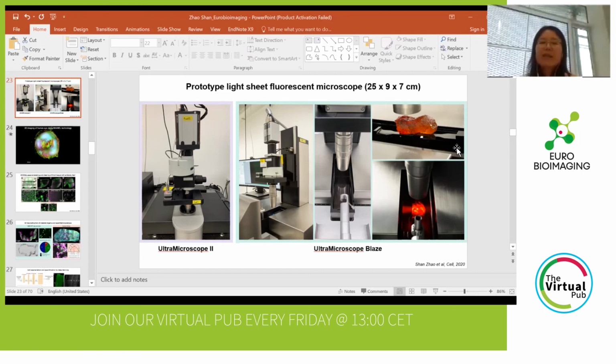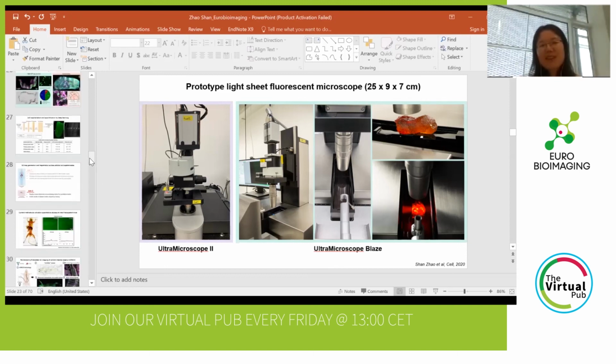So right now, imaging one mouse takes 3 to 4 days. So basically, it has already greatly reduced our lab work, and also sped up the whole process. But of course, right now the limiting thing is that the computer has to handle this kind of big data. We save it and we analyze it. That also takes time. Yeah.